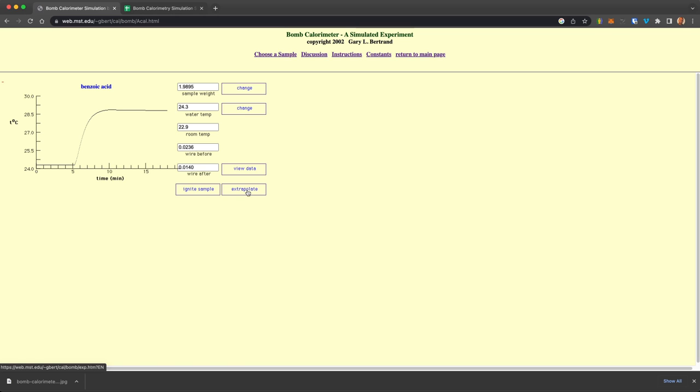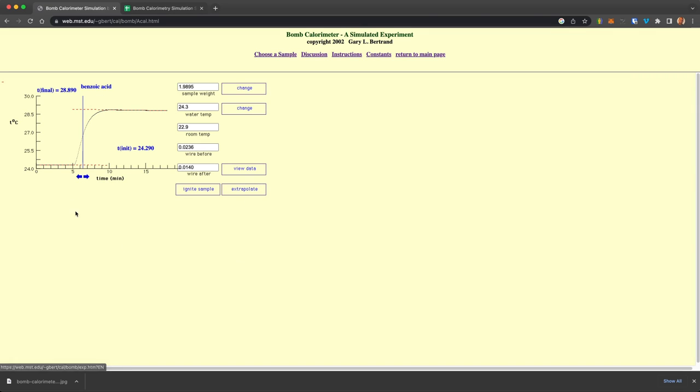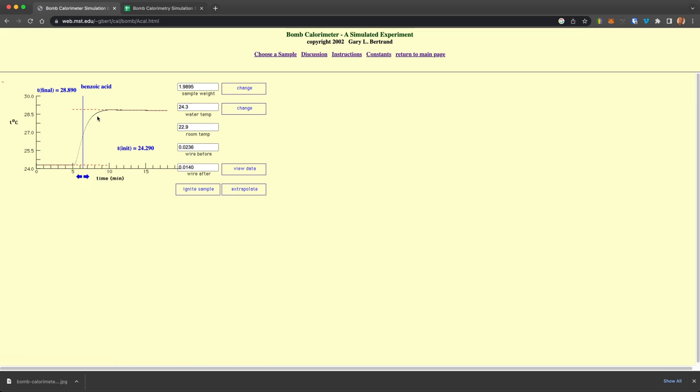So you can extrapolate and get what the change in temperature here is. So we'll go ahead and click that. And now you can see it's extrapolating the initial temperature and final temperature. And you can move this around to get what the change in temperature is from the ignition of this or the combustion of benzoic acid.